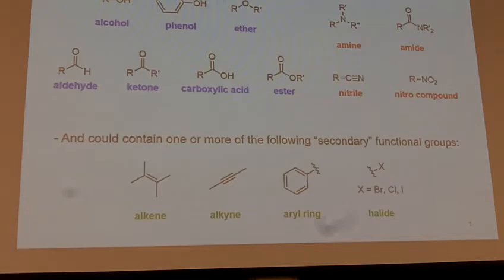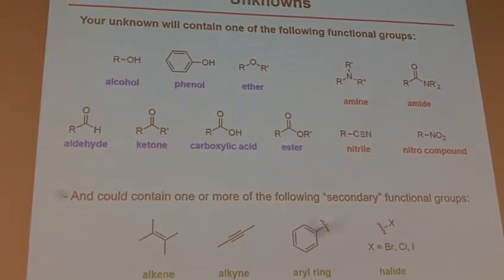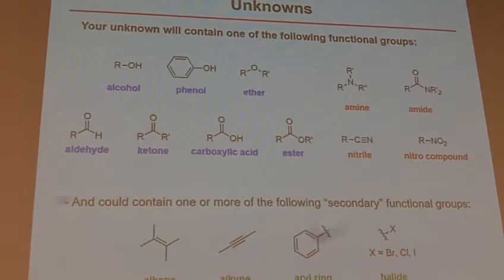But to have an alkene or an alkyne, you also need a positive permanganate test. If you don't have them both be positive, it's not an alkene or alkyne. So both bromine and permanganate can give you positive results for other functional groups, okay? But the only groups that they will both test positive for is the alkene or alkyne, all right? So keep that in mind.